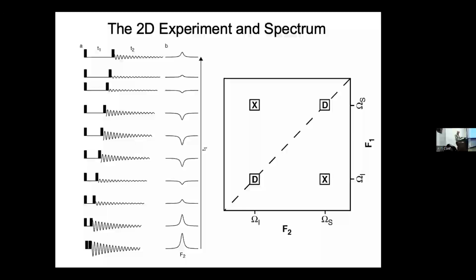So we have a spectrum as a function of our real acquisition period. And the appearance of that spectrum, as you can see, is modulated by whatever happened during the T1 period as the pulses got further and further apart. So again, this change in amplitude or phase is what we want to analyze to resolve the different components in our density operator.